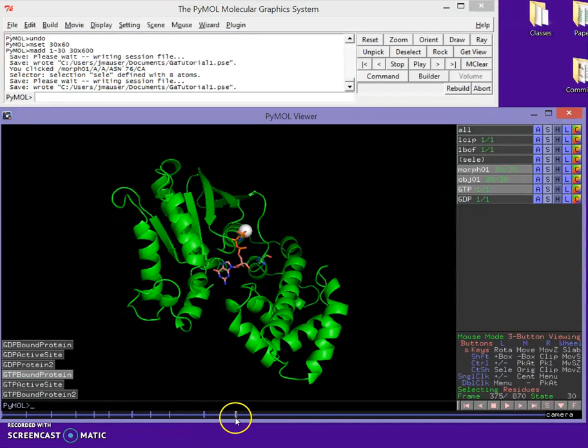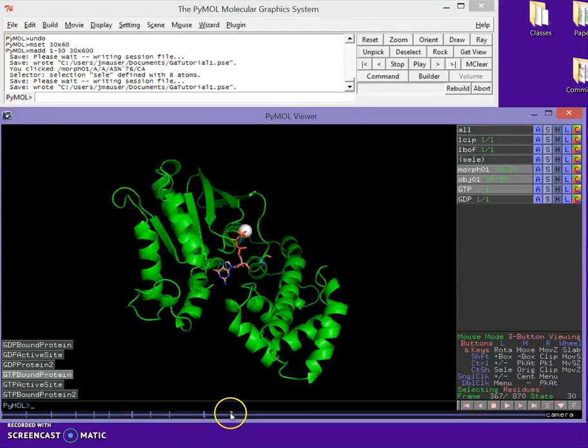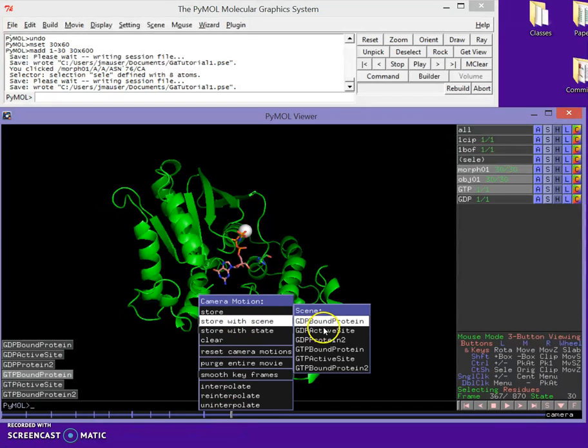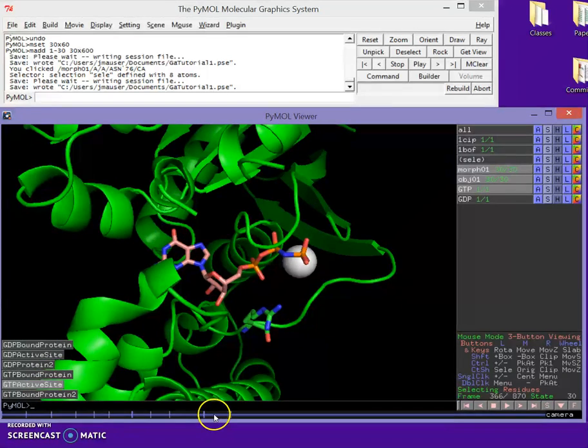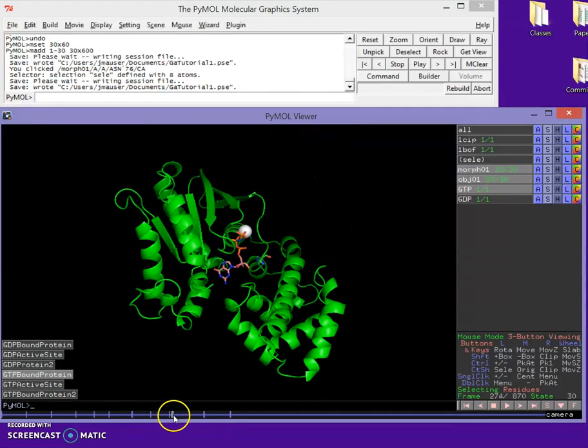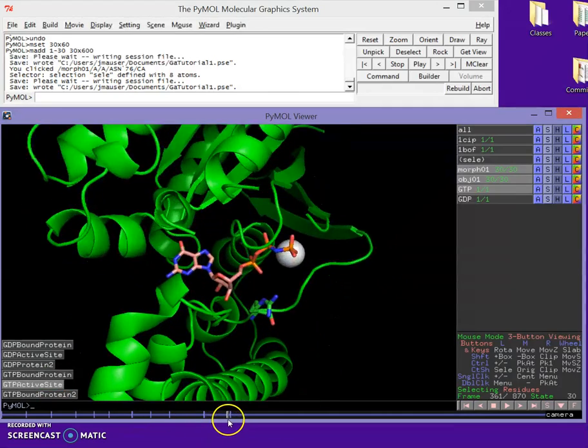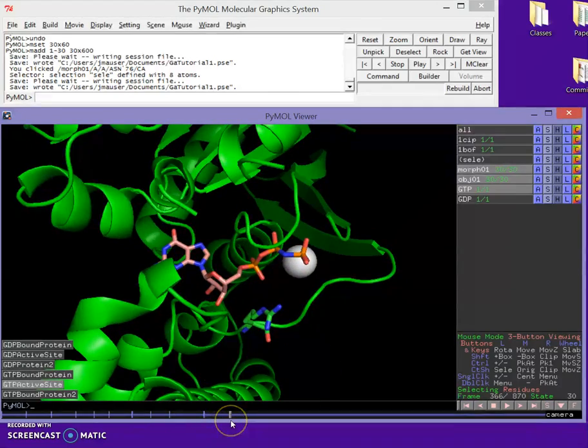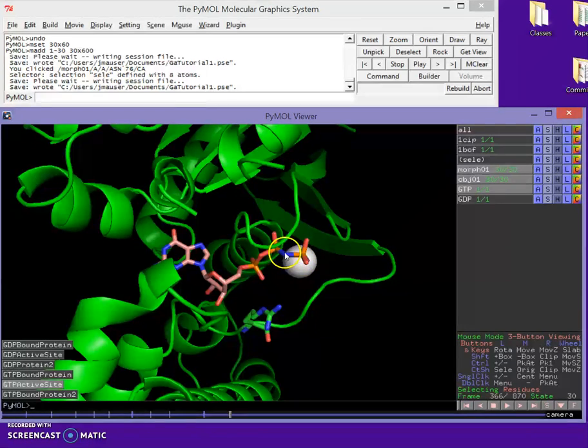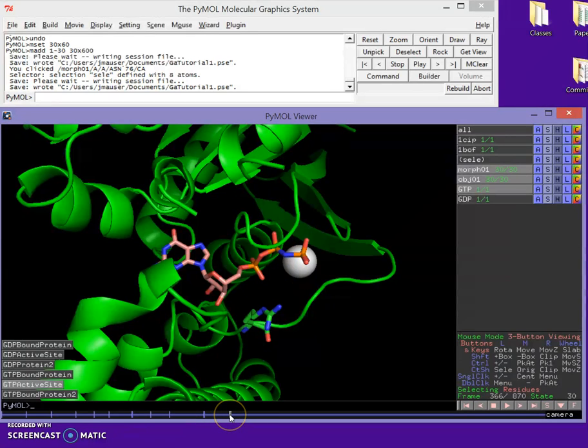Now I want to zoom back in on the active site, so I'm going to move my cursor out here and store with scene GTP active site. We're going to get a chance to admire our protein after the morph, and then it's going to zoom in on the GTP in the active site. You can see the three phosphate groups here. This one you can see is actually a nitrogen, which makes it non-hydrolyzable, so you can actually solve the structure.